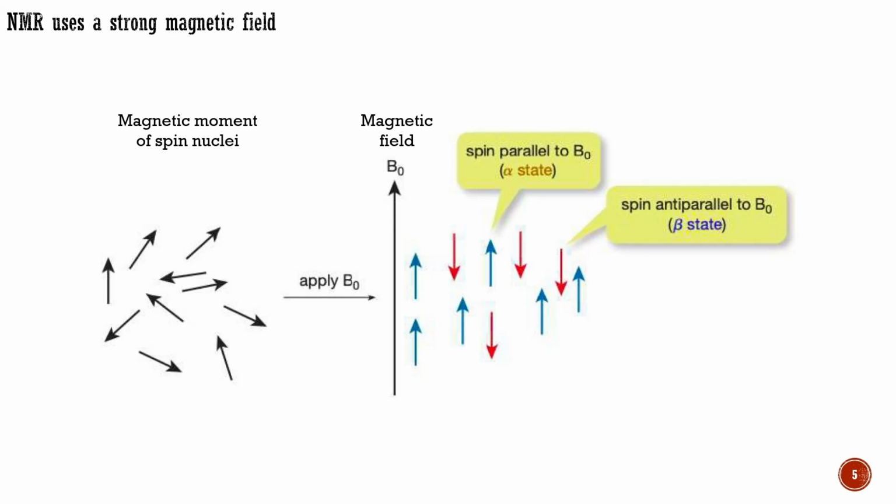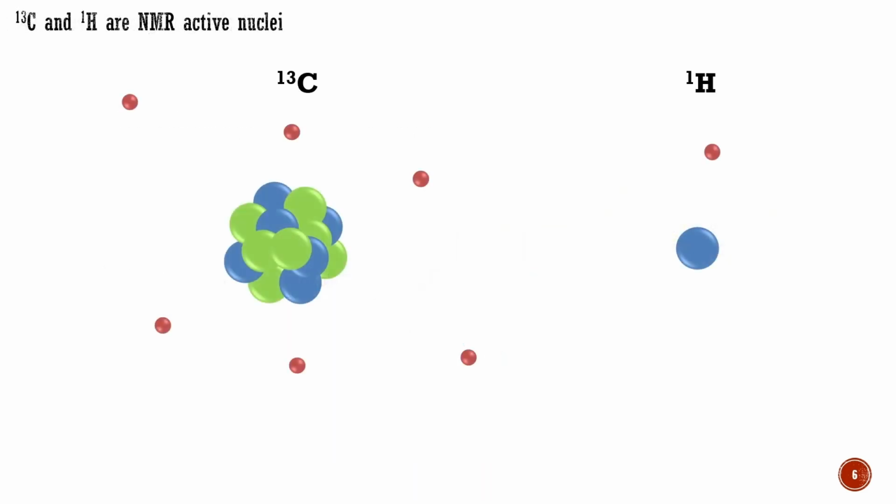Just as a compass needle has to be made of a magnetic material to feel the effect of the Earth's magnetism, so it is that only certain nuclei are magnetic. Many, including normal carbon-12, do not interact with a magnetic field at all and cannot be observed in an NMR machine. But the minor carbon isotope, carbon-13, does display magnetic properties, as does hydrogen-1 or protium, the most abundant atomic nucleus on Earth.